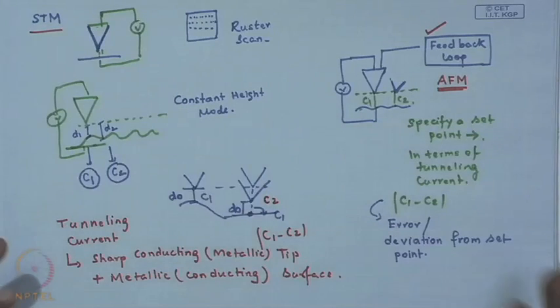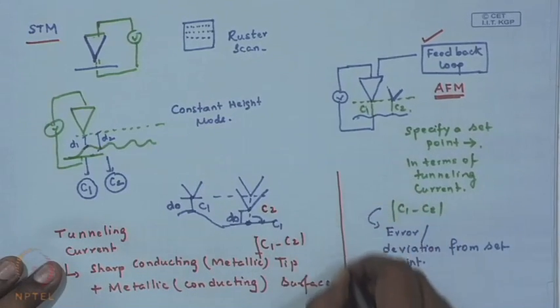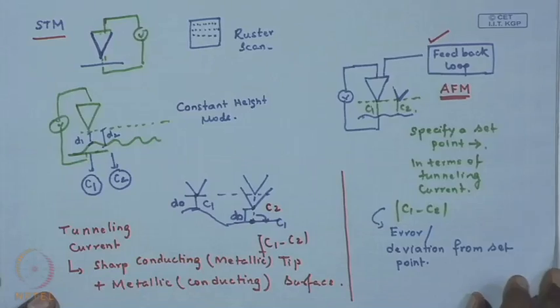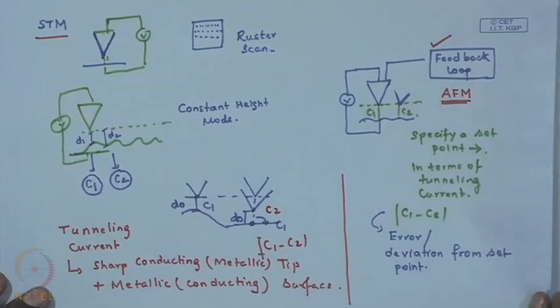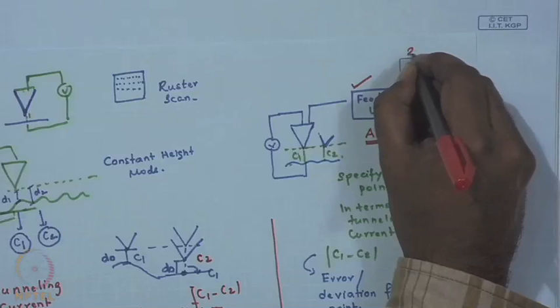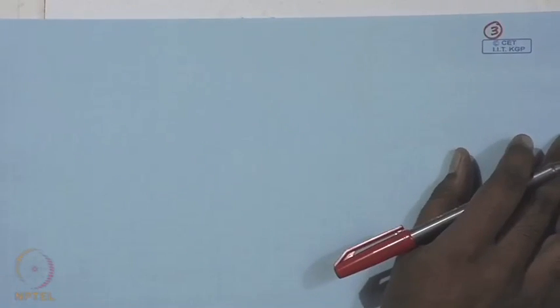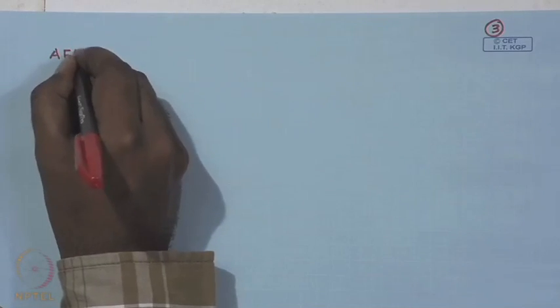However, still I think this much amount of fundamental knowledge in STM will help you both to understand how the AFM evolved, and also STM as a technique itself is extremely powerful, and there are many application areas where the STM finds rather significant application. With that, we now move on to atomic force microscope, which, as I have already pointed out, is to a large extent based on the developments related to STM, or in every true sense the STM was the predecessor of the AFM. So, let us see what are the advantages.